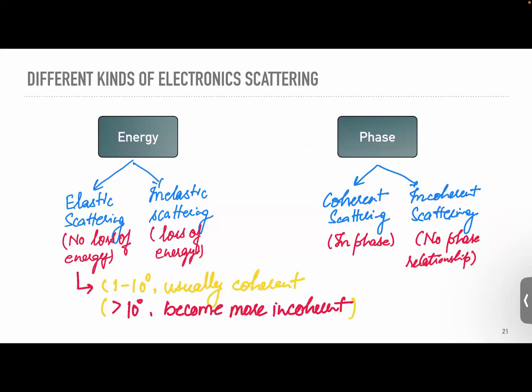When you say coherent and incoherent, do you consider similar types of electrons? Do you say two Auger electrons have scattered coherently, or do you consider all sorts of electrons? Actually, sir, if we are talking about Auger electrons, it is impossible that they are coherent. Okay, meaning near to impossible.